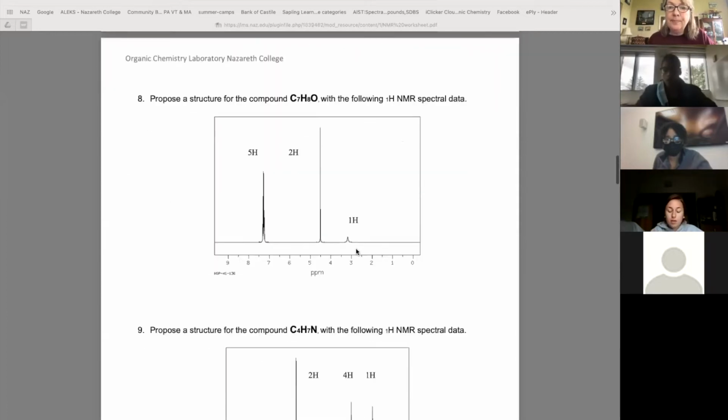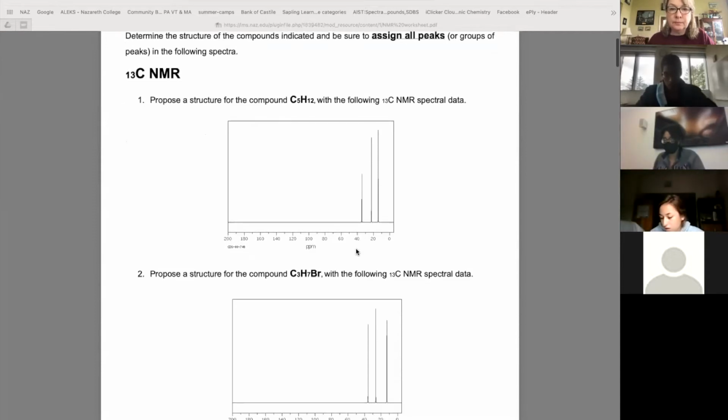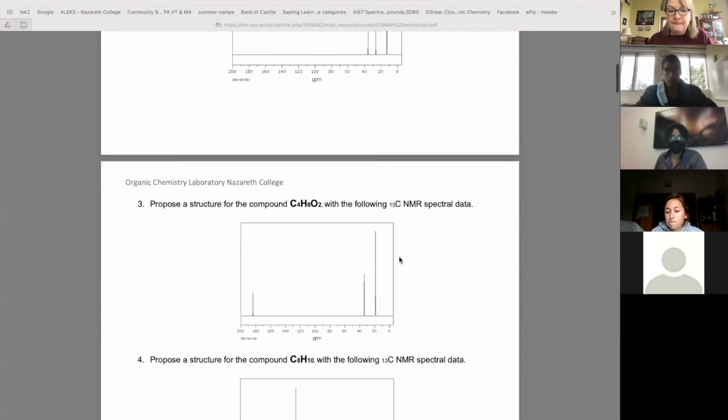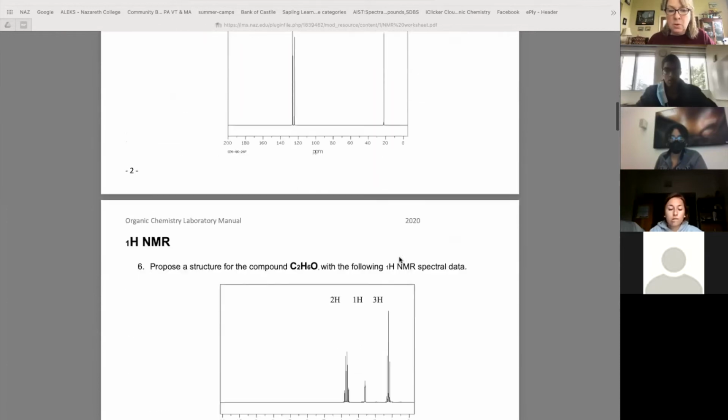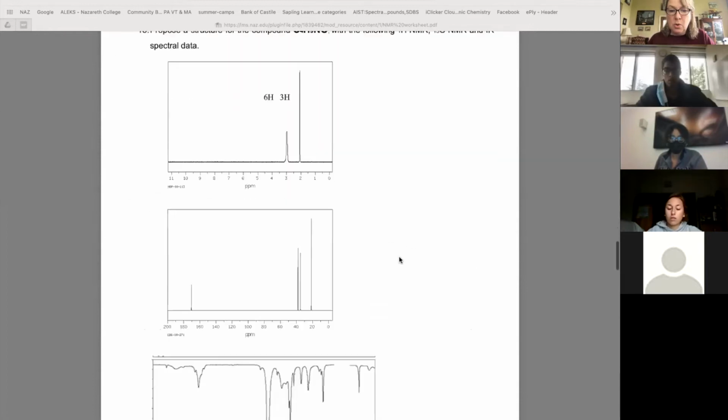Number one? Just get a baseline for carbon NMR. We kind of already did it, but I have some questions. I know that alcohol is like the smooth tongue and benzene is the jigsaw, but I have trouble remembering. We need to know about downward and upward peaks and whether they're on the left, right, or middle. The far right is the fingerprint region, which we don't need to know, but I have trouble knowing the shapes of all functional groups. It's a lot about memory.